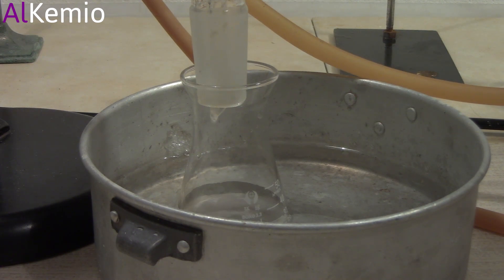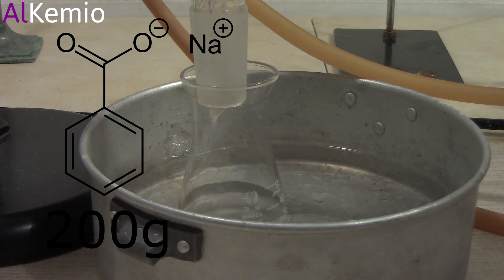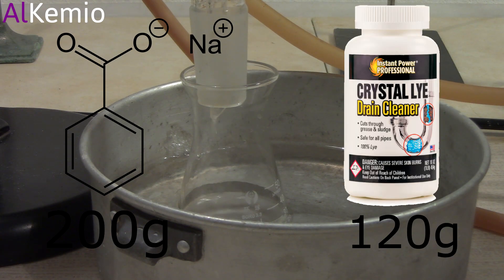Welcome to Alchemia. Today we'll be making benzene by decarboxylation reaction. I decided to use 200 grams of sodium benzoate and 120 grams of sodium hydroxide.